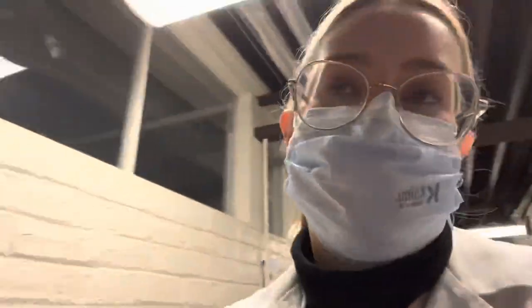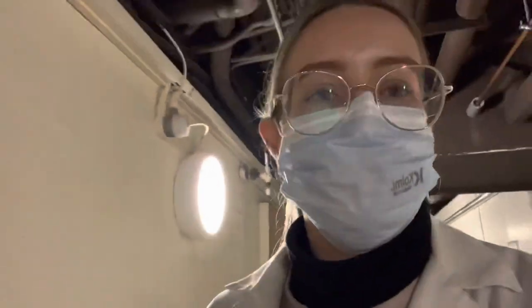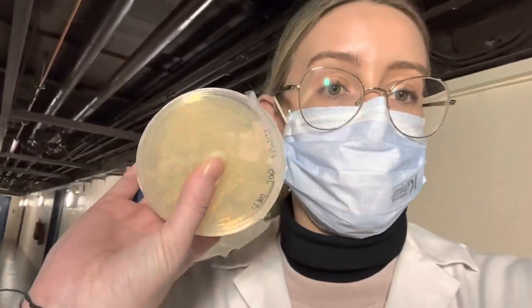So I feel like something might have gone wrong, but we will see from the results how they turn out. I'm currently not convinced. I might have to repurchase a few of them because they were stored incorrectly when they first arrived, because I wasn't here and I didn't realize that they had to go in the freezer. So I feel like that might have damaged some of the compounds potentially. I'm doing this for the first time and I have no idea how these compounds react, so it's very, very tricky. But for now, let's make my overnight cultures.